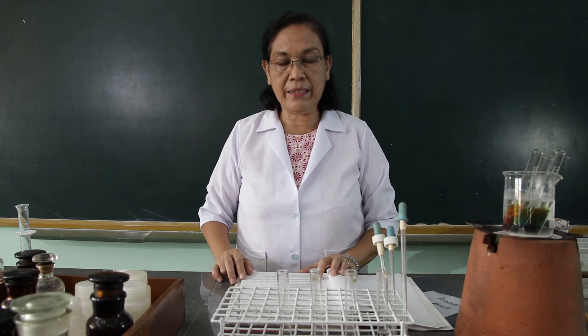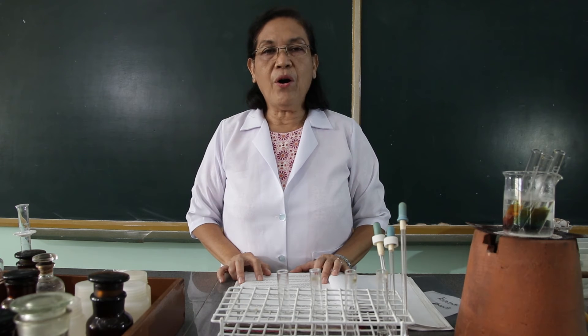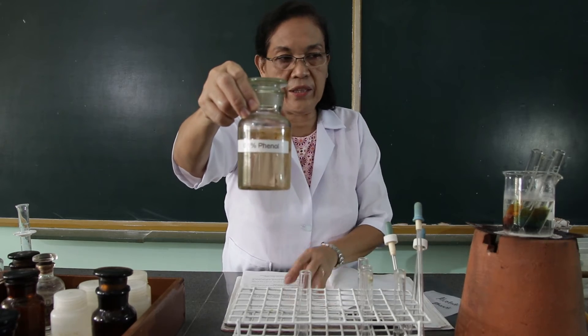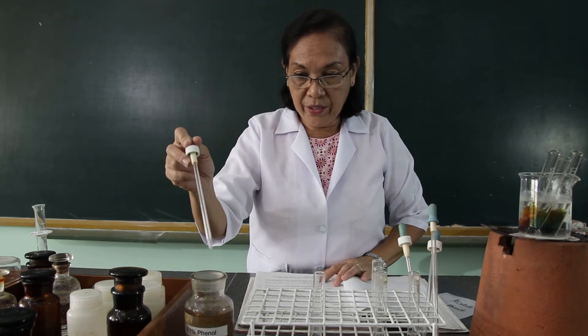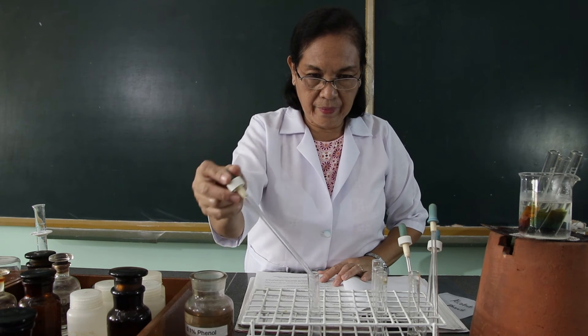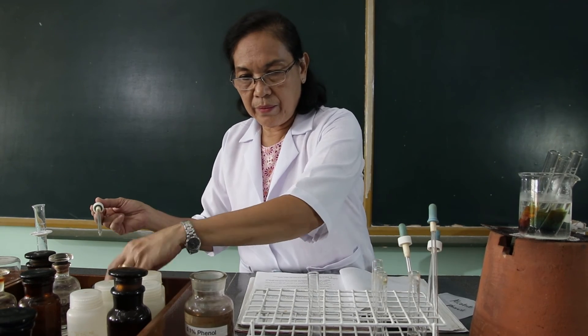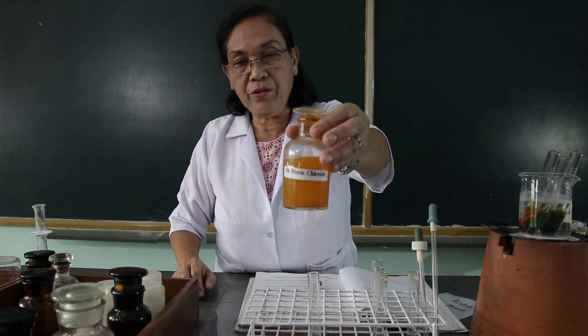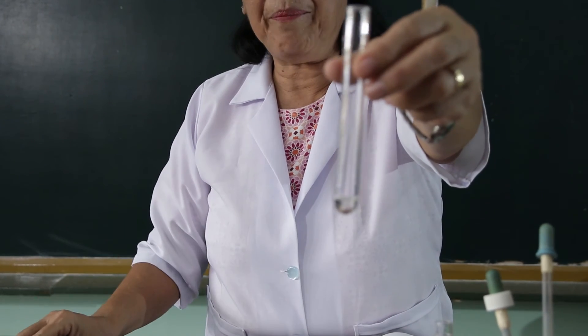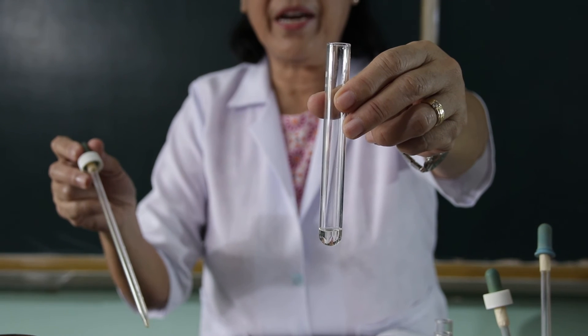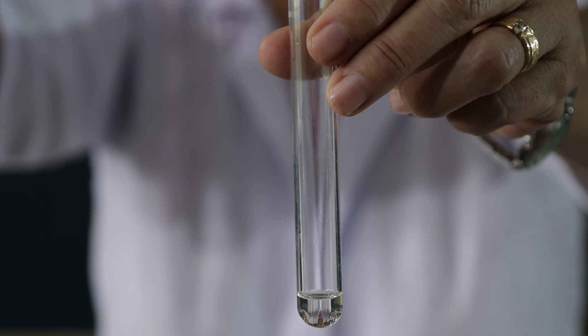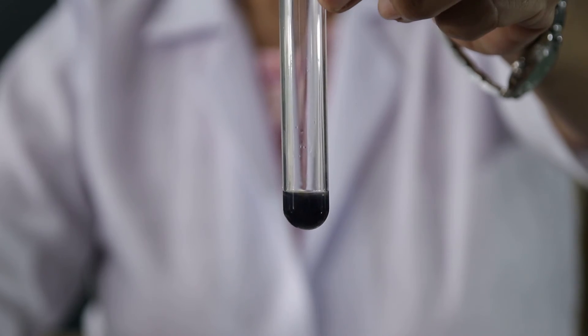For the third part of the activity, we're going to test the reaction of phenol towards ferric chloride — this is what we call the ferric chloride color test. Using 1 ml of the 0.1% phenol, we're going to add one drop of the ferric chloride solution. Observe what happens when I drop the ferric chloride onto the phenol. What happens to the color?